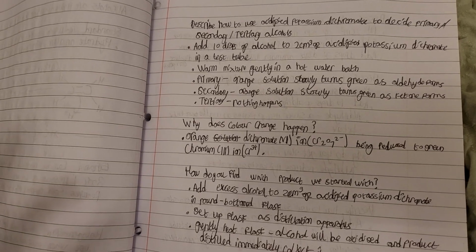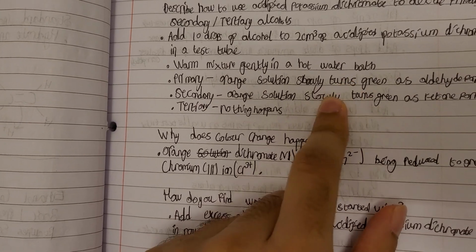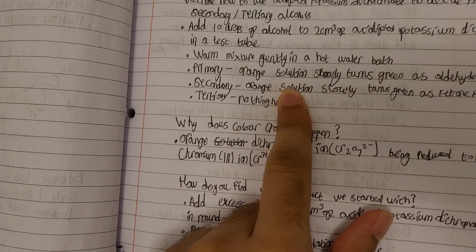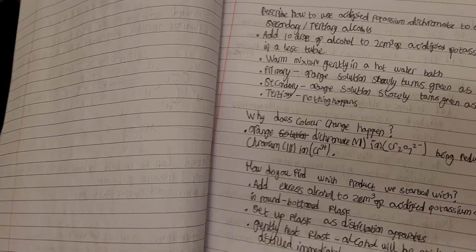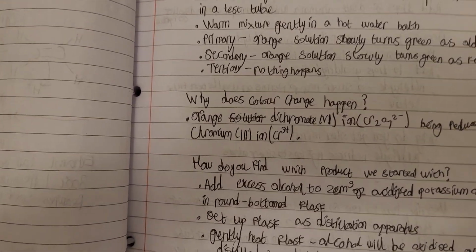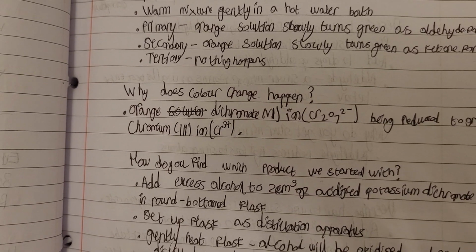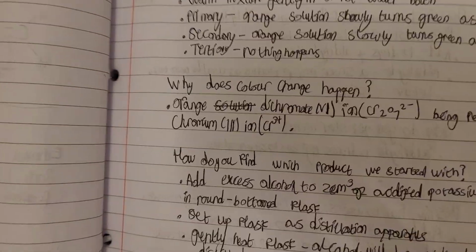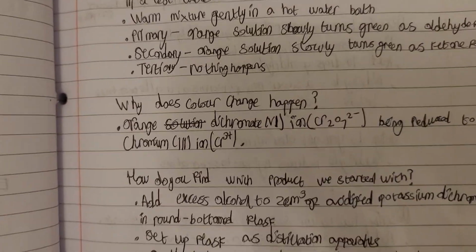The problem with this test is that both of these have the same observation. The aldehyde forms, the orange solution slowly turns green. The ketone forms, the orange solution slowly turns green. So why does the color change happen? Well, the orange dichromate(VI) ion, Cr2O7 2-, is being reduced to a green chromium(III) ion, Cr3+.